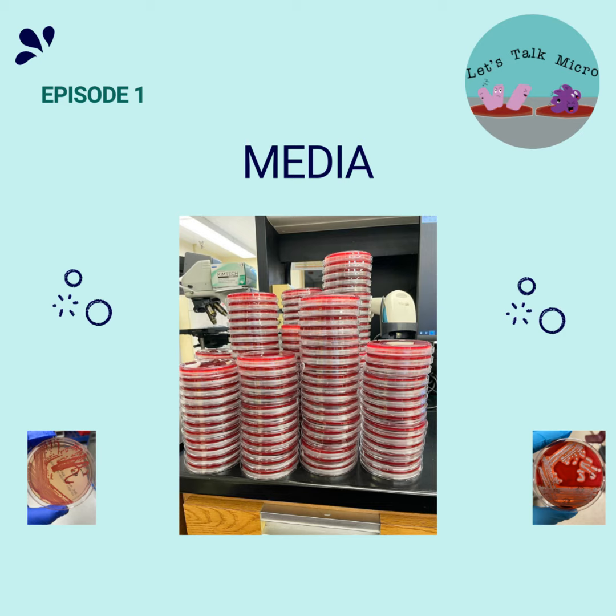And that brings the question: we have our media, right? And how do we put those samples in the media? Well, it all depends on the source. Basically, if you have a sore throat and they swab it, if you have a cut and they swab it, you basically swab one portion of the agar. If you have urine, you stick a loop in the urine sample, and then you put that on the agar. If you have body fluids, depending on the amount, you can centrifuge it and add some of that sediment to it. So it just basically depends on the source.